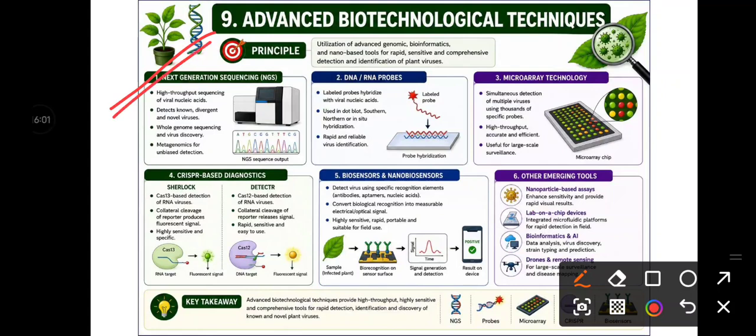This is a very high-throughput sequencing technique for virus detection. So the whole genome will be sequenced, and using the data generated we can predict by blasting. If you know something about bioinformatics, you can get the genome, nucleic acid BLAST, protein BLAST. So by genome BLAST we can check which sequence is there and which virus may be associated.